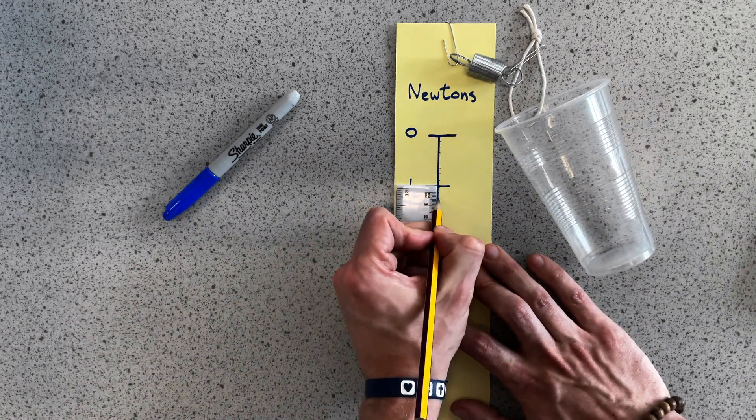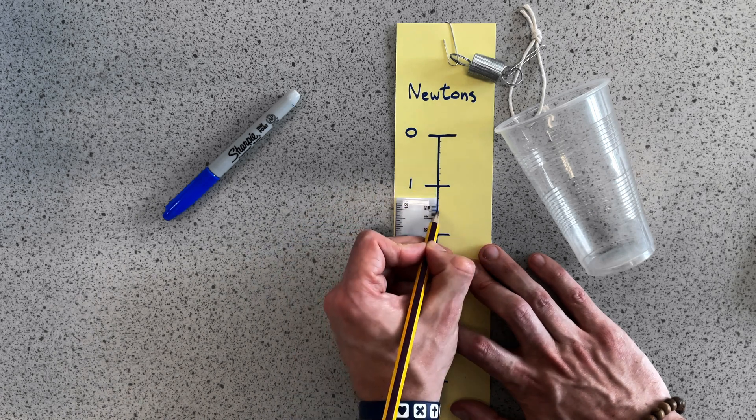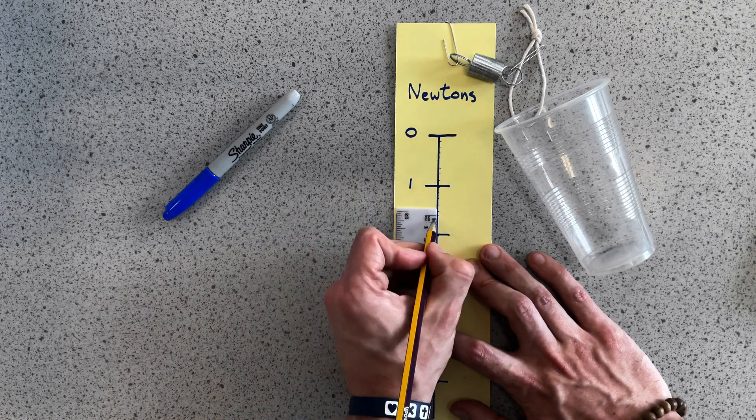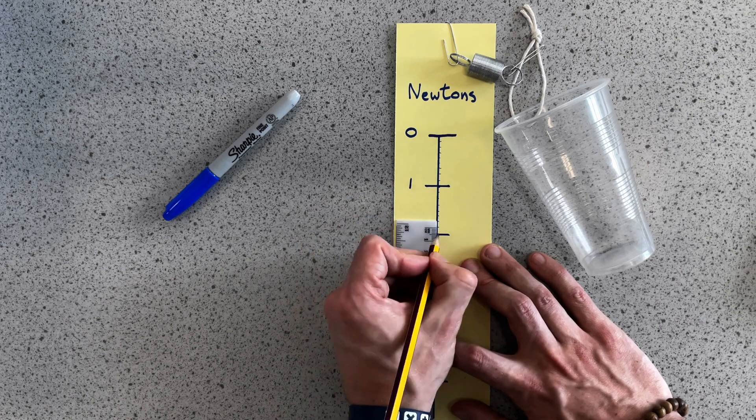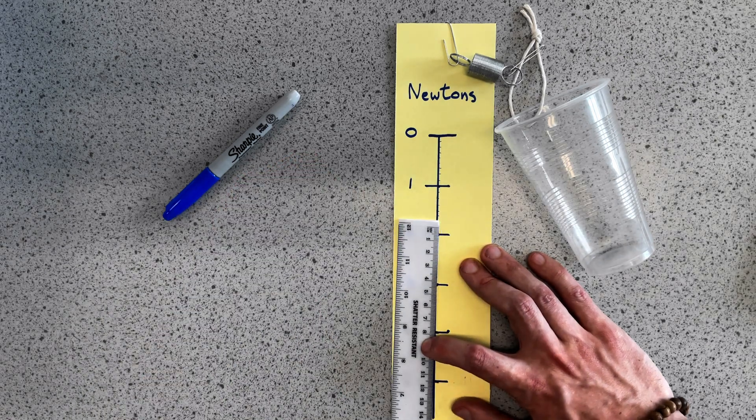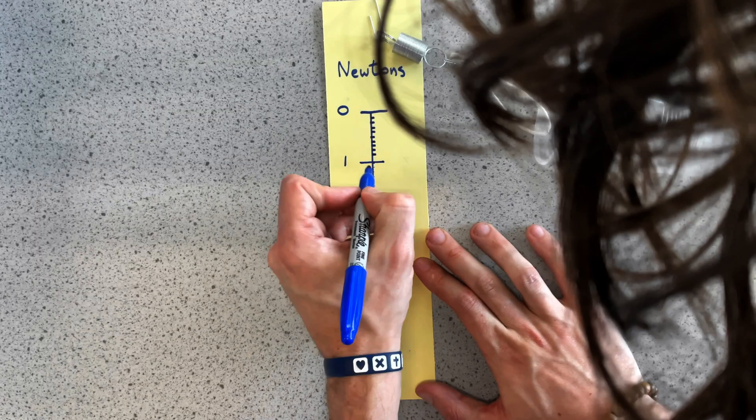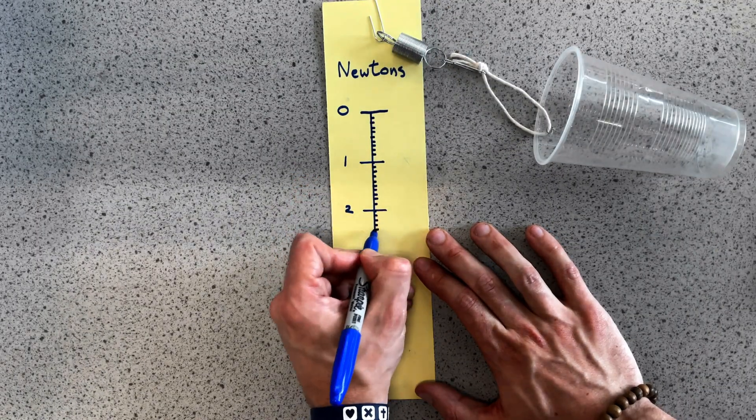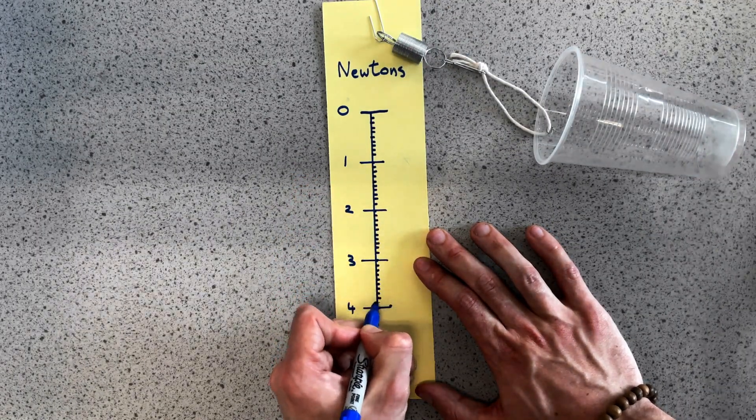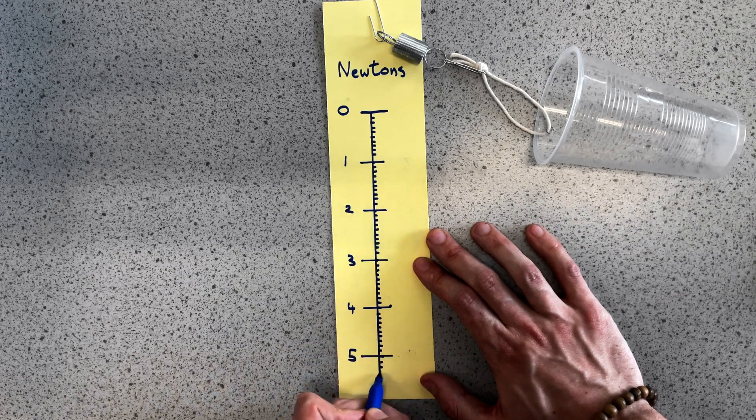To do this I take the distance between my lines which for me is 3.56 and then I divide that by 10 which gives me 0.356. So I'm going to try and put marks every 0.36 centimeters which is roughly three and a half millimeters and I'm going to do that all down my scale.